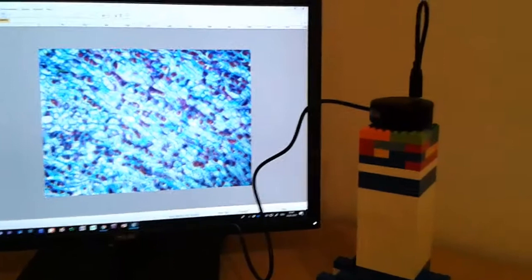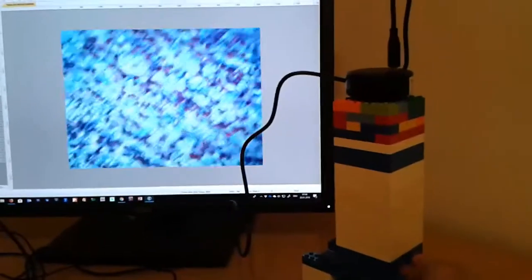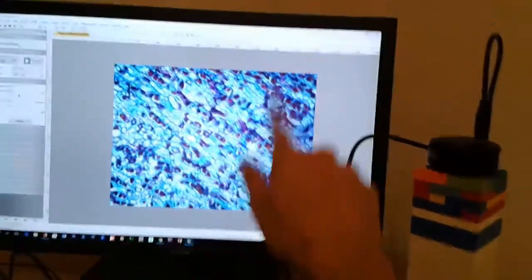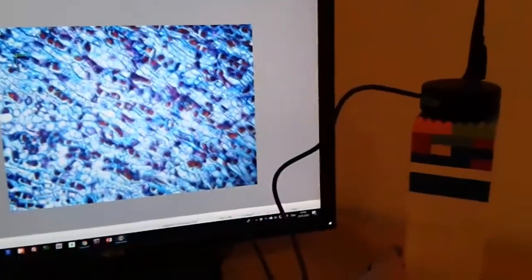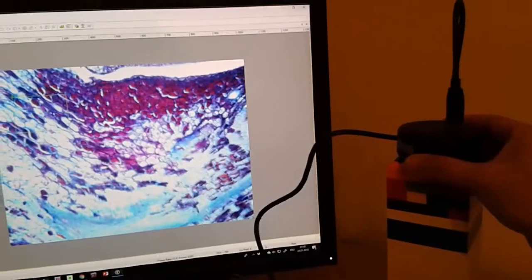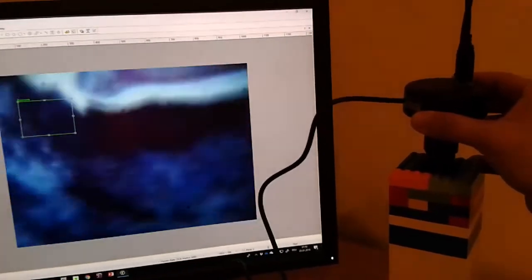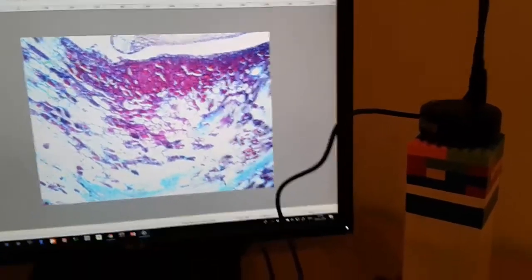I don't know if you can see this, but it's a little bit blurry on the corners on one side. I discovered why: it's because the objective is wiggling a little bit — if you push the objective, the whole picture also wiggles. So the objective down here must be straight, otherwise one half of the image is blurry and the other one is not. But that's not a real big problem because if you know what to do, you can just push the objective into the right position again. By moving the camera in and out you can change the focus. Now you can see the picture becomes more blurry the further I move it out, and when I put it back in again it's back in focus.